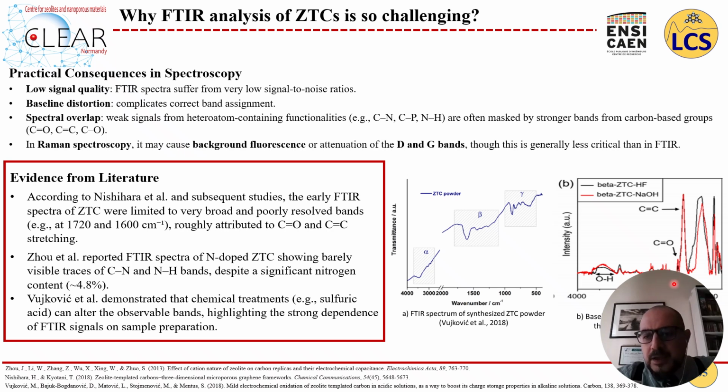Here we can see a small peak of the C=O carbonyl band, but a strong one with a huge post-production done by baseline correction, while in this case we can see only the C=C bond stretching, but we cannot see any C-O related to the carbonyl group.